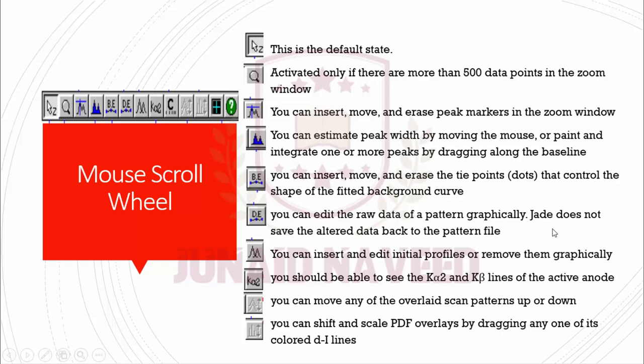With this button you can edit the raw data of the pattern graphically. Remember that JADE will not save the altered data pattern to the main file. You can insert and edit initial profiles or remove them graphically with the help of this button.